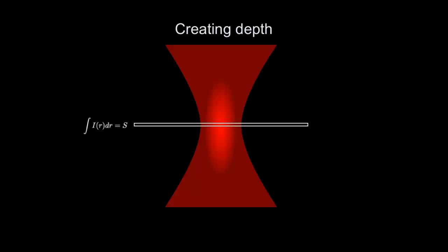Okay, so let's have a look at this. Hopefully you can see this. Again, you can see here the focal field, but below and above there's also excitation light. So this is what we call an excitation cone. The light comes from below, it travels up, it is condensed or confined here, and then it diverges again out. All right?